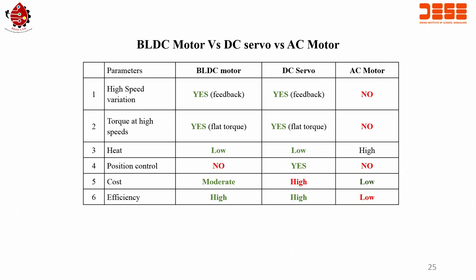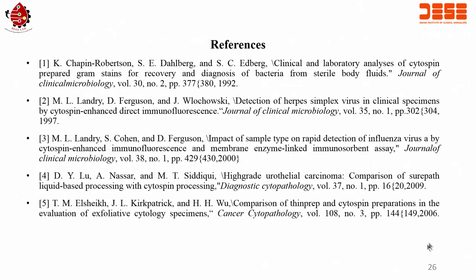So, when you talk about system building, you need to understand, okay, should I use a BLDC motor, DC servo, or AC motor. When I compare the speed, torque, heat, position, control, cost and efficiency, I see that the BLDC motor can help us to solve the problem. Same thing, we can think of using the DC servo also. So you have the option of comparing and then selecting which particular system you can use.